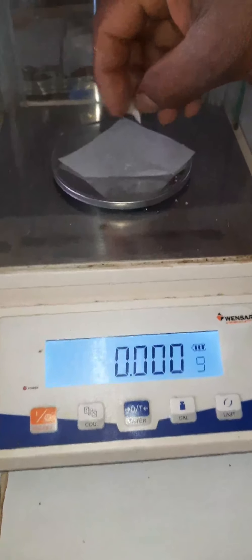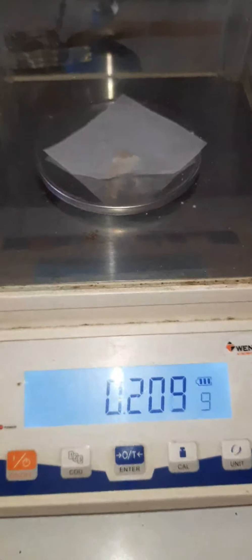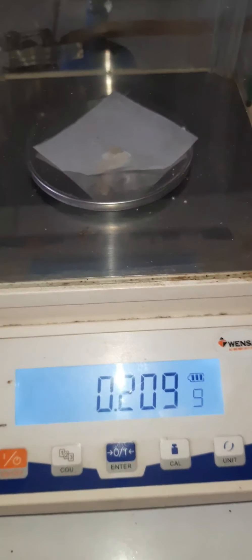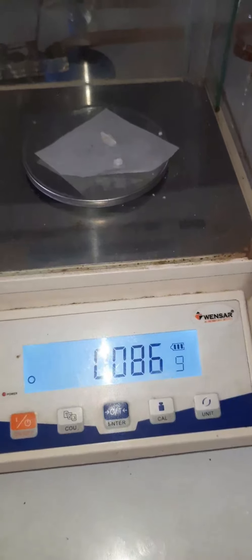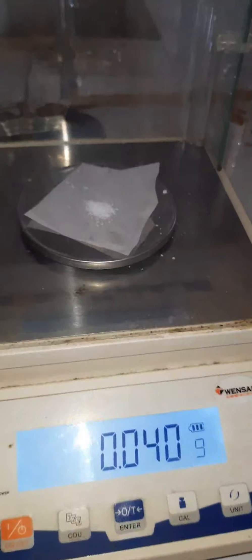Now the spermaceti wax is taken for weighing on the balance. Now the borax is taken for weighing and is weighed on the balance.